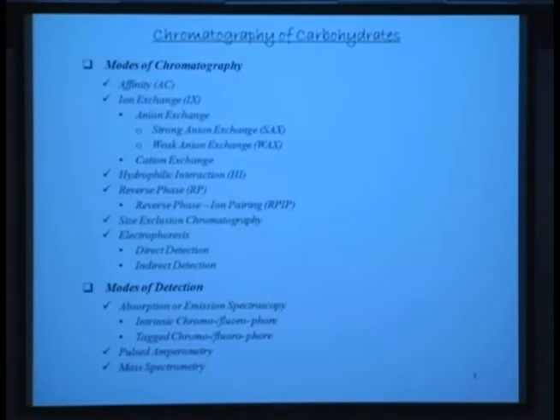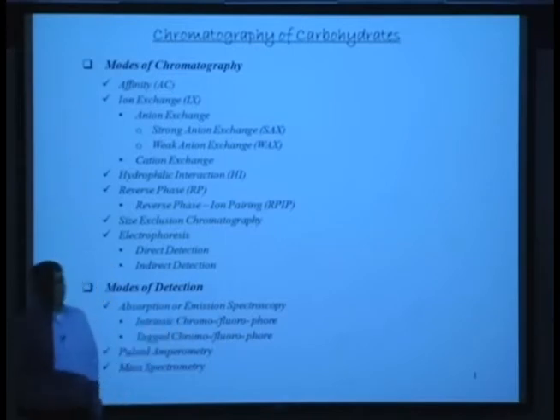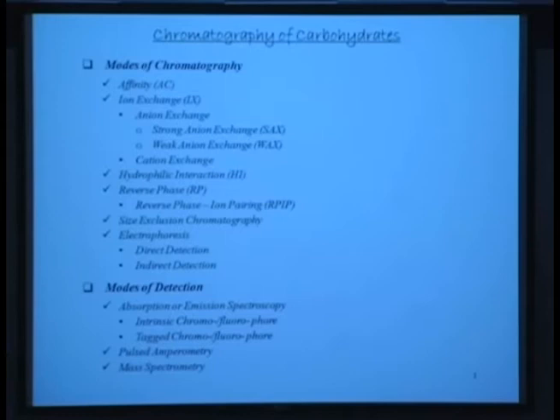So a number of times these chromophores can be intrinsic, and we are going to see one example. Kubi has already talked about that series of molecules. If it is intrinsic, obviously that helps detection. But the majority of times, chromophores have to be tagged, attached.